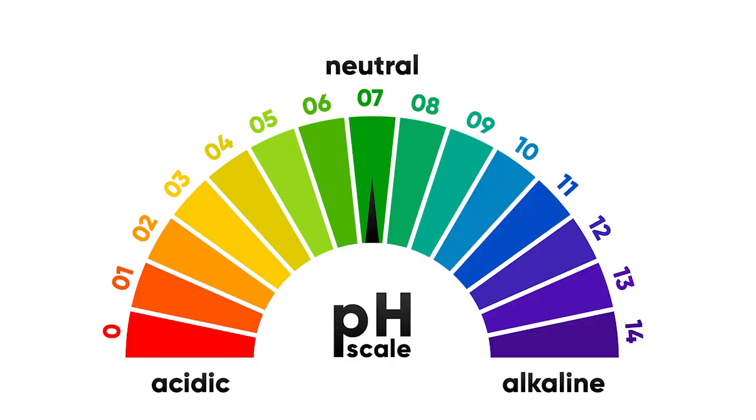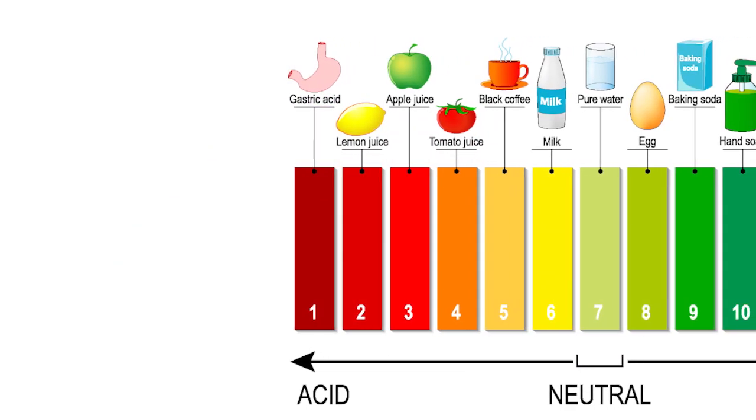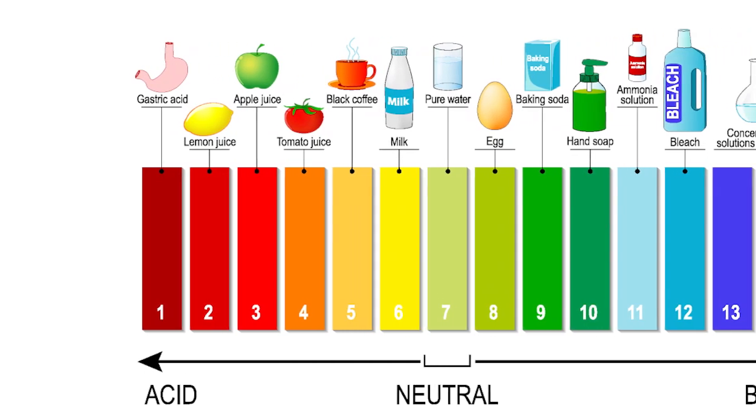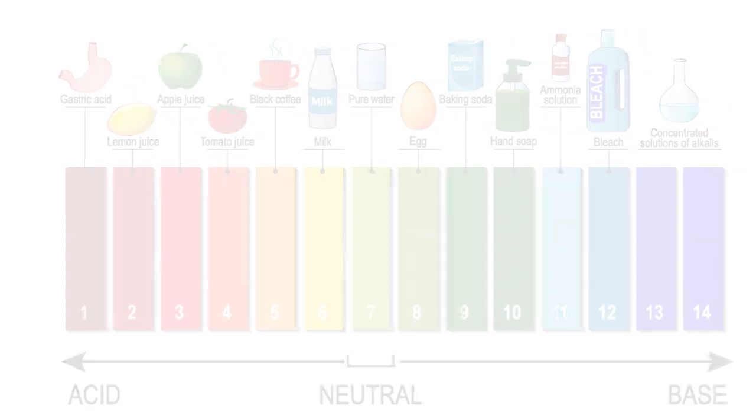The pH level of your corrosive chemicals determines how corrosive the substance is. The lower the acid's pH level is, the more corrosive the acid will be. For example, a strong acid may have a pH level of 2, while a weak acid may have a pH level closer to neutral, such as 6. Be aware, corrosive bases and alkalis with high pH levels can also be corrosive and extremely dangerous if exposed to the skin, such as ammonium hydroxide.